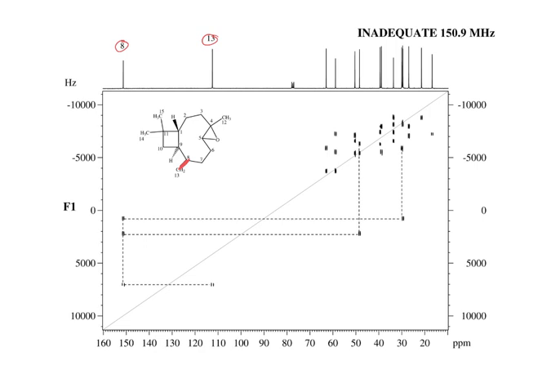They're tricky to solve because usually you'd use an HMBC to put things together, but there's sometimes fewer protons around the outside, and you have these carbons that are buried in the middle of this aromatic structure. And it's hard to see coupling from some of the protons on the outside to the carbons in the middle.